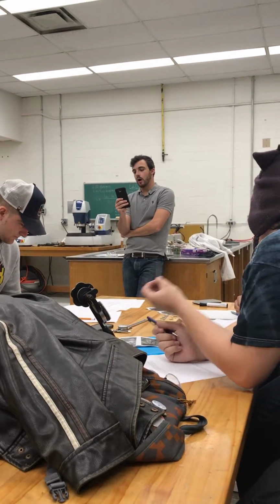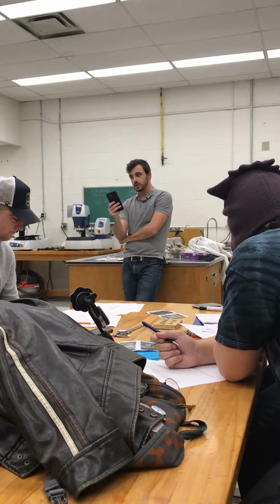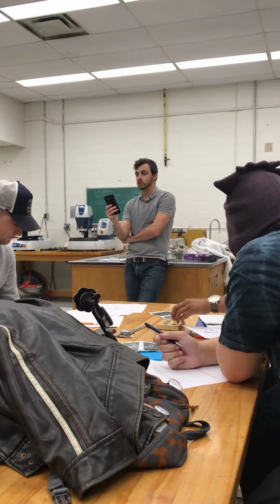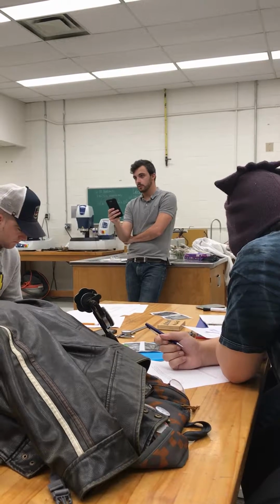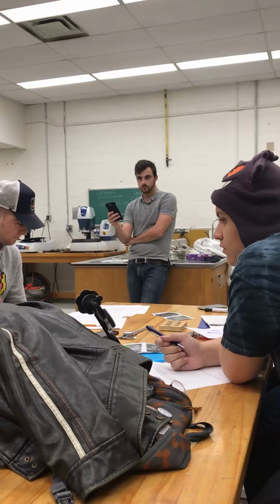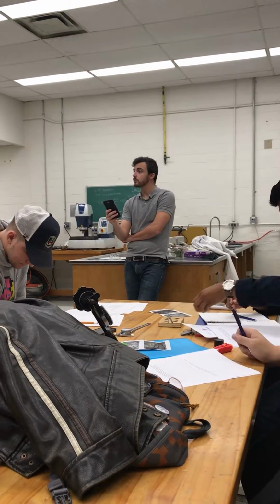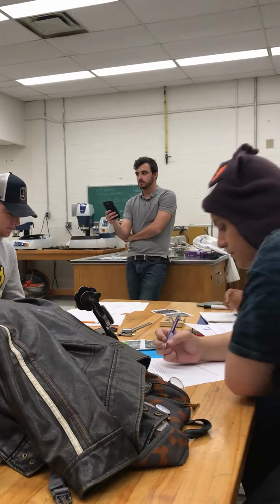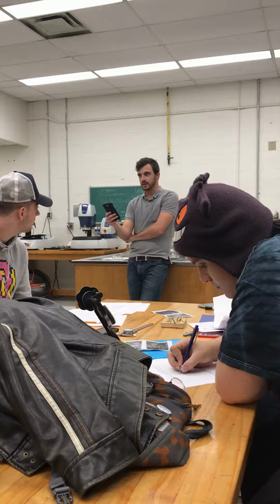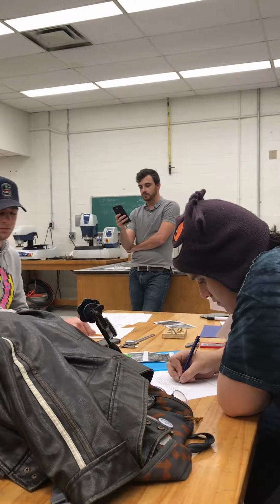Now, I would like you guys to specifically pay attention to the presence of surface scale, which covers the surface and will potentially change the color of the sample, as a very major identifying factor. How do I know if this got surface scale? So, coloration of the surface. You pay attention to surface scale specifically. It is probably your best identifier. Talk about everything else, but when you're determining what is what, I would use surface scale over other things.